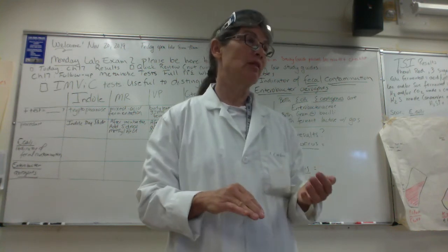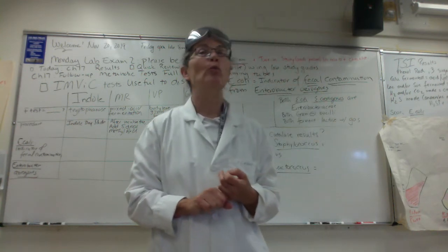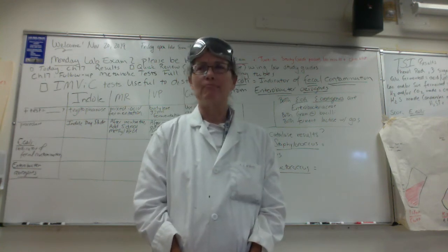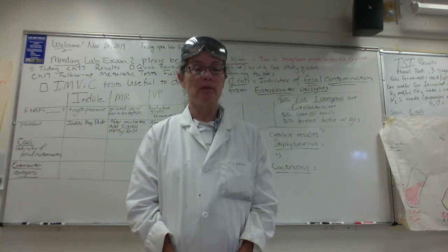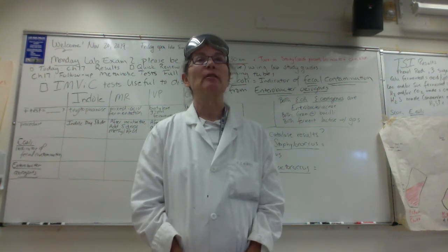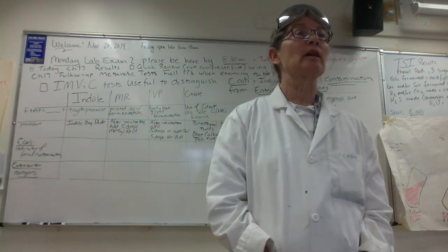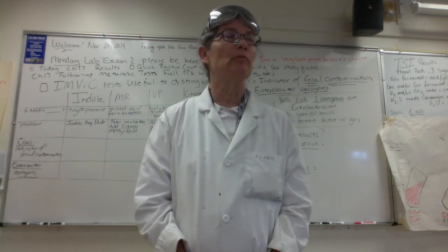Now there's different citrate media. The one we use, I love it, is Simmons citrate agar. Which pH indicator is present in Simmons citrate agar? Great lab exam question. Bromothymol blue, good. So folks, if your microbe can use citrate as a sole source of carbon and energy, the final pH will be what? Acidic or alkaline? Alkaline, good. And what color does bromothymol blue turn at alkaline pH? Deep blue, beautiful blue color.